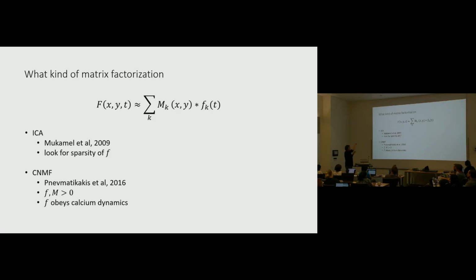So you go up, and then you decay kind of exponentially, and you go up, and you decay. And so you can put all this information into the algorithm. As I said before, you can try to make the simulation as realistic as you can, and then you have a better and better model of this volume.